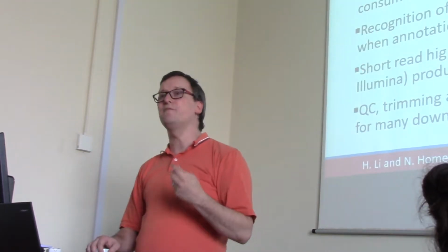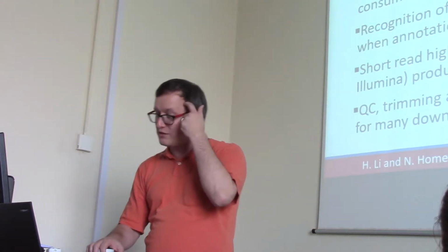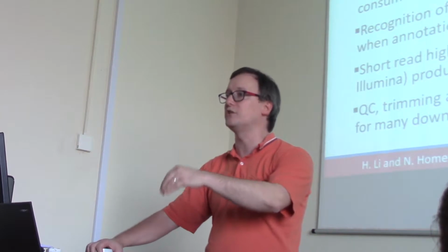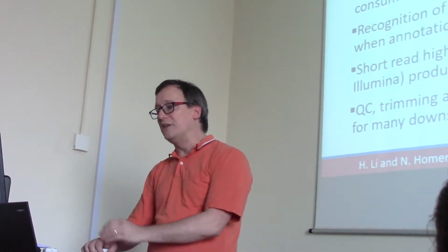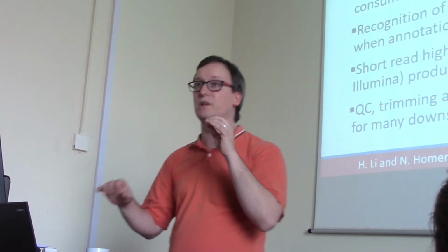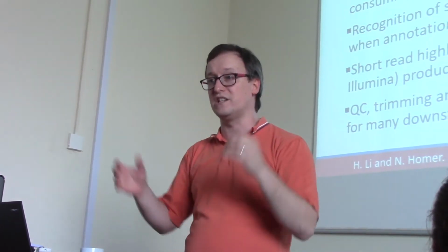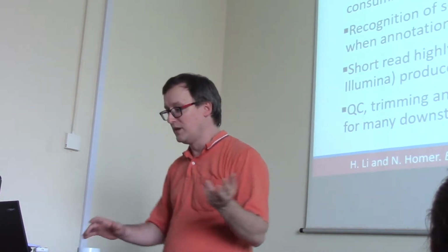So why do we need to emphasize the alignment problem for short reads? Now we're making our shift from the technology itself, from the instrumentation, to how we manipulate the data from it. So we have several options. One would be called a de novo assembly. A lot more about that tomorrow. De novo assembly means that we try to just stitch all of these short reads together into longer and longer contigs until we're able to explain all of the data.